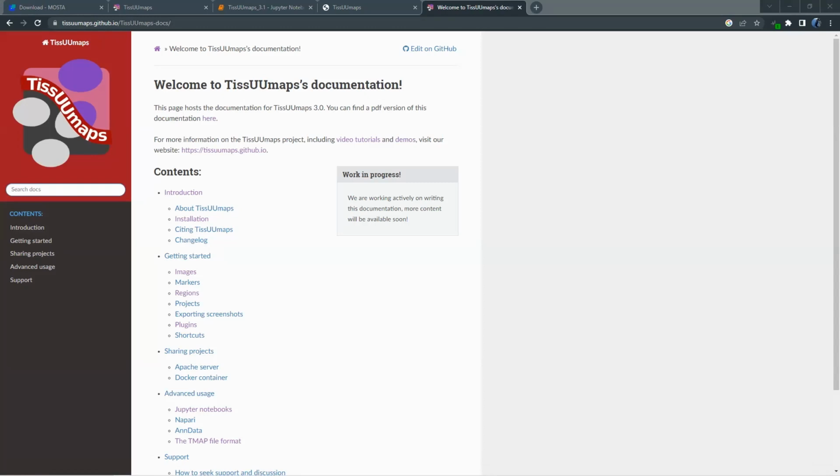So to answer Swan Liu, if you have just an Apache software server, then yes, you will need to export a static web page. So the question is, if I understand correctly, we have to export the single cell RNA and spatial transcriptomics as static web pages separately. Yes. If you have a normal Apache server, then you would need to have each one as a different web page.